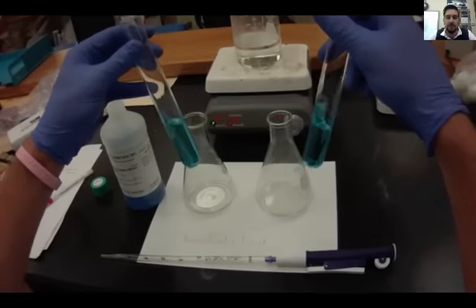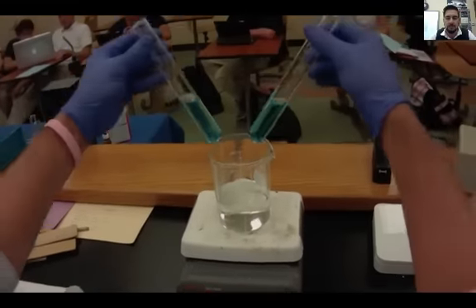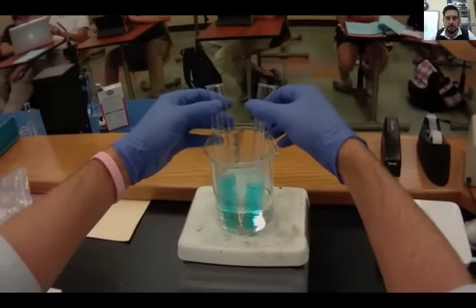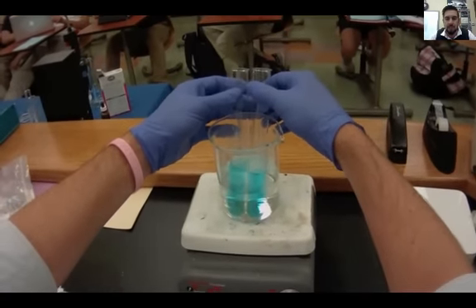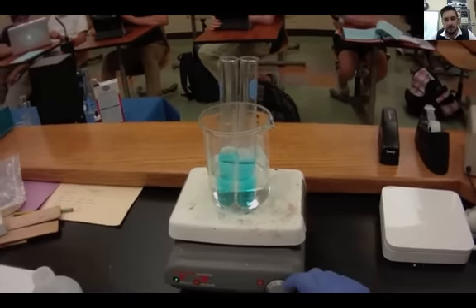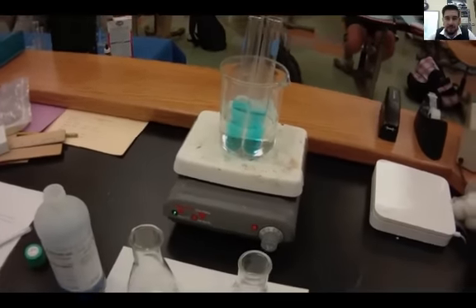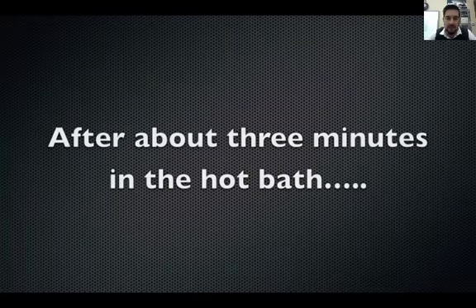Shake them up, shake them up. All right, heat them up, heat them up, there we go. I'm going to let them sit for about three minutes, but we're not going to wait three minutes. All right, at the end of three minutes, which should be right now, yep, three minutes.